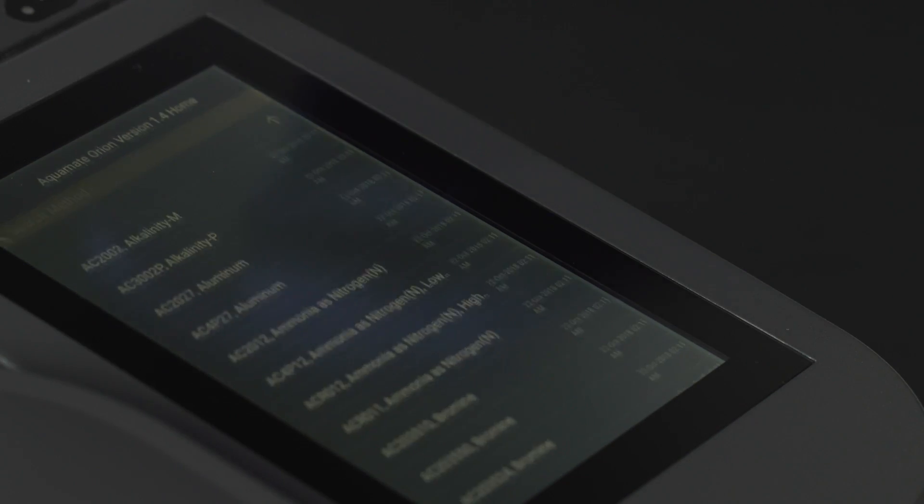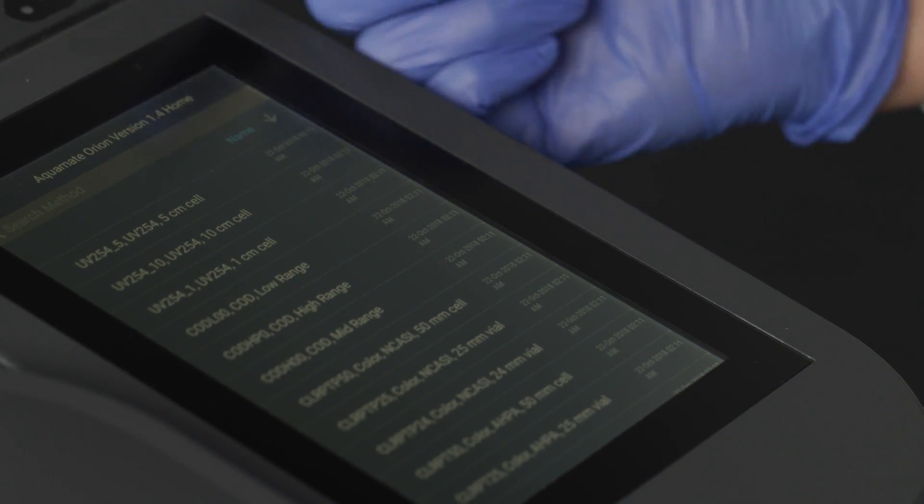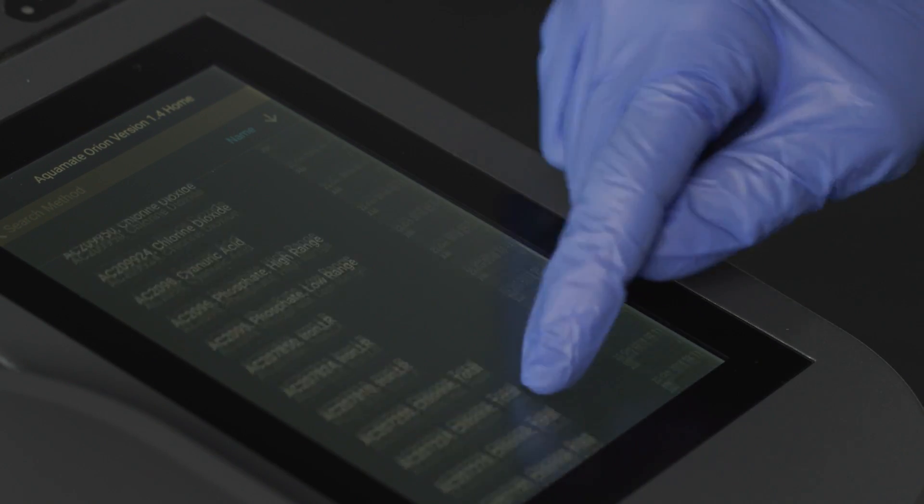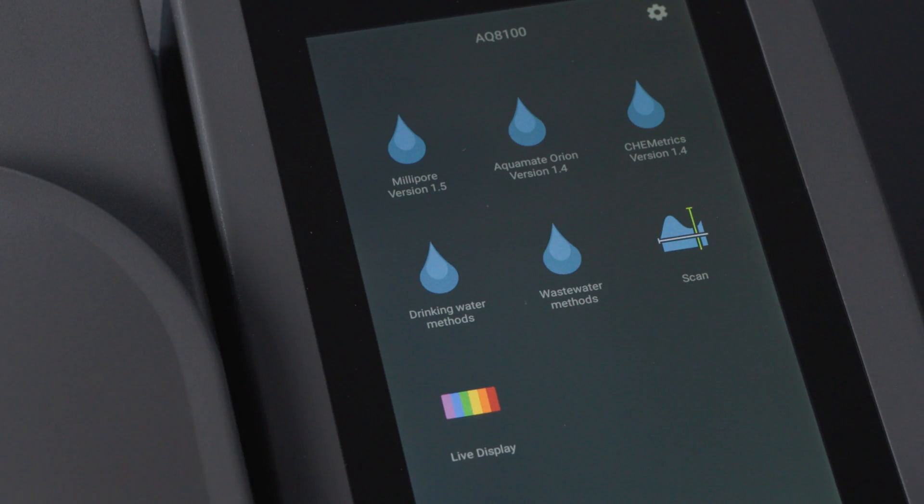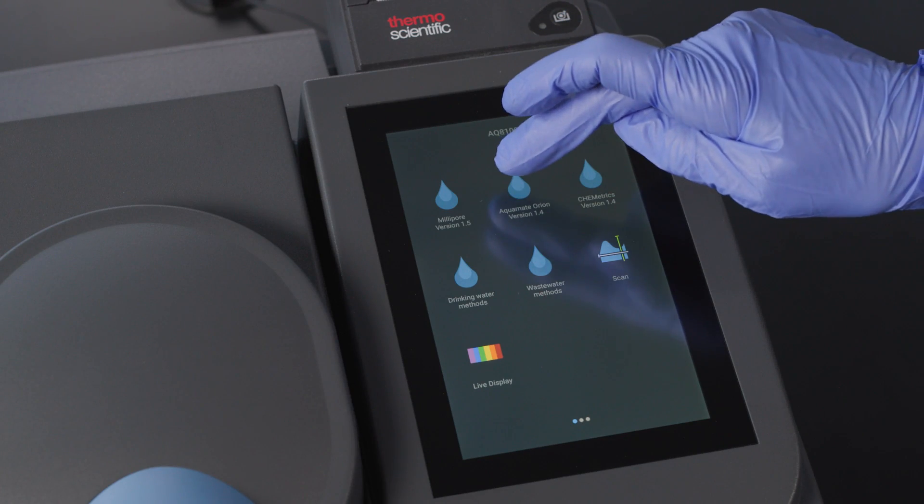We have over 260 water analysis methods that I talked about before organized in easy to find water drop icon folders. For example, here is the Orion methods folder.